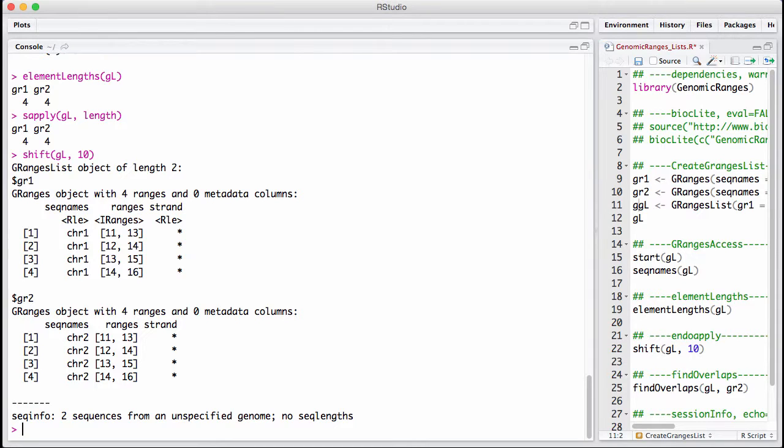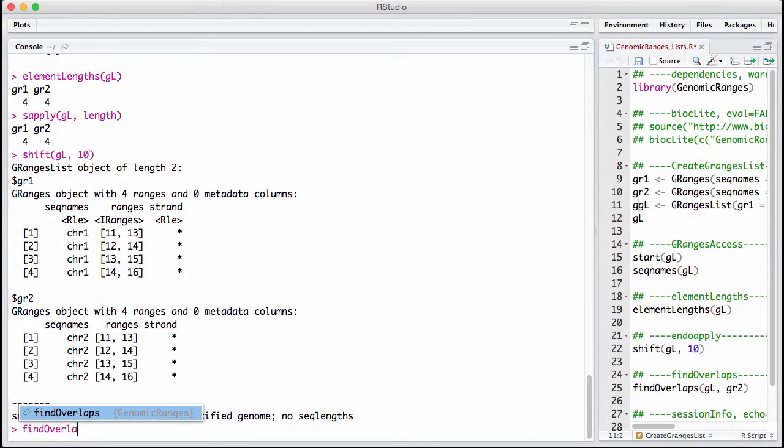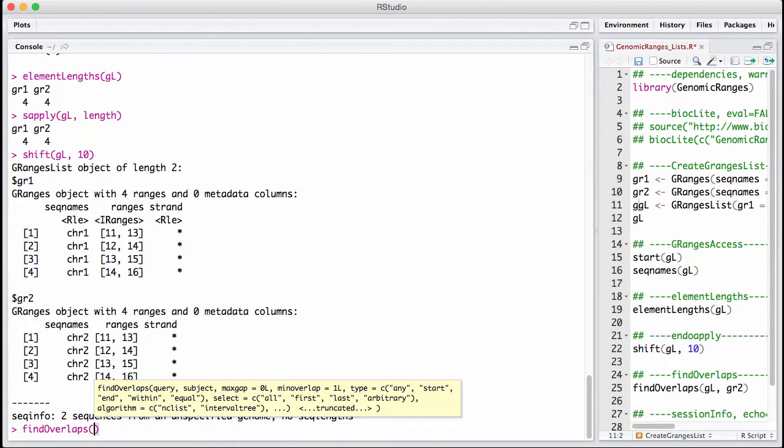We can use findOverlaps. And here the situation is a little different. Let's look at the output and explain it.